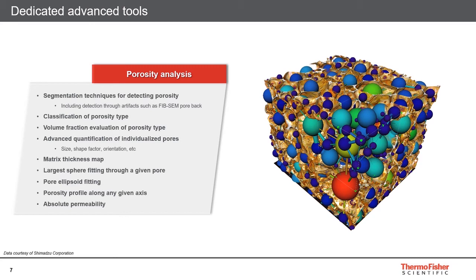For porosity analysis, Avizo Software allows identification of pore throats and separation along them. It enables the conversion of the pore space into a model, known as a pore network model, representing pores and their connectivity. Various properties can then be color mapped onto this pore network model. Avizo Software also provides advanced pore space statistics such as pore size distribution, pore throat size distribution, channel length, and more, and it provides filtering of the model based on property.